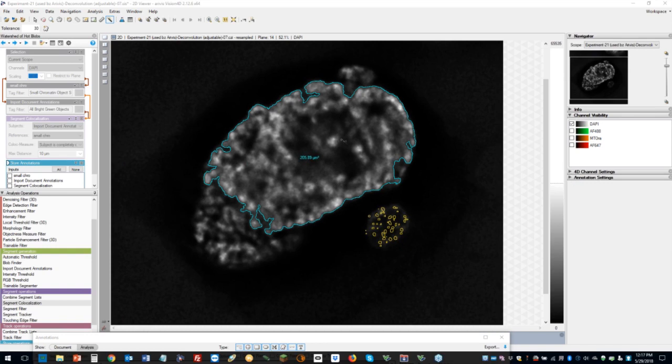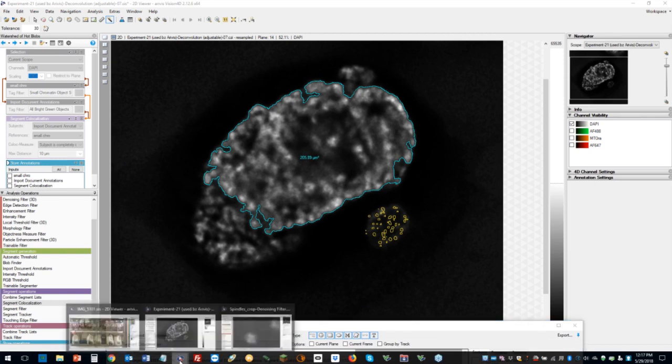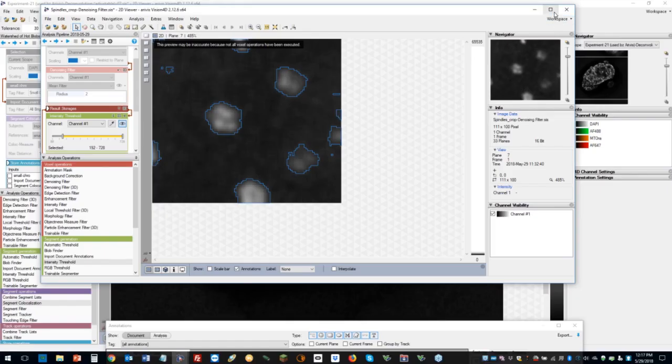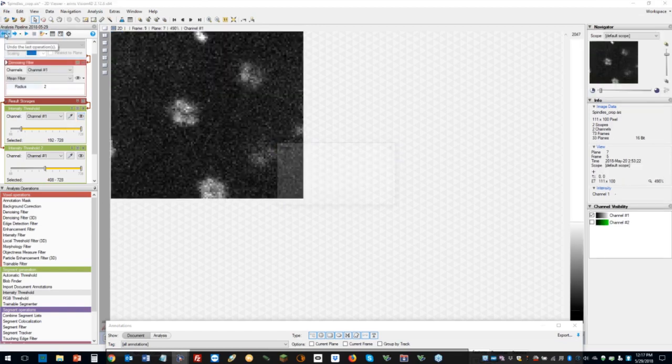And I think we had a little bit of debate about whether we should cover the tracking stuff in this webinar, because we all like it very much. It's really cool, but we thought it might be a little bit too much for the webinar. But we can absolutely do tracking in 3D. Maybe I can make Vision 4D track for us quickly here.